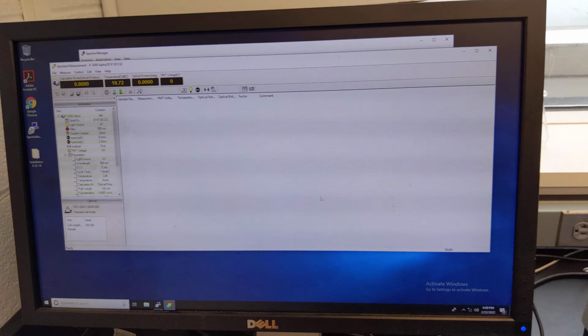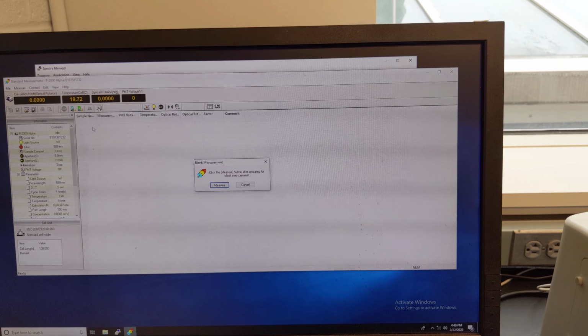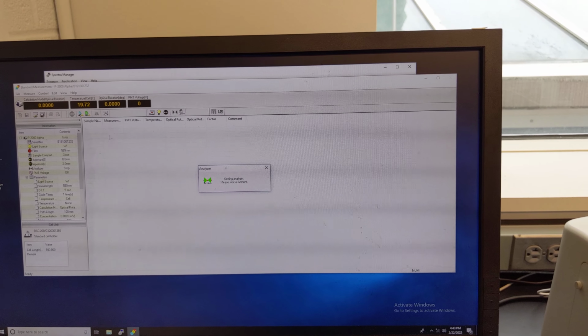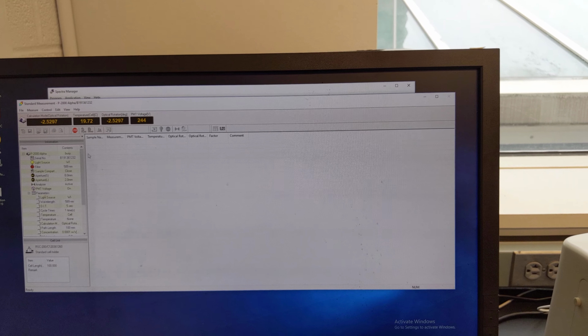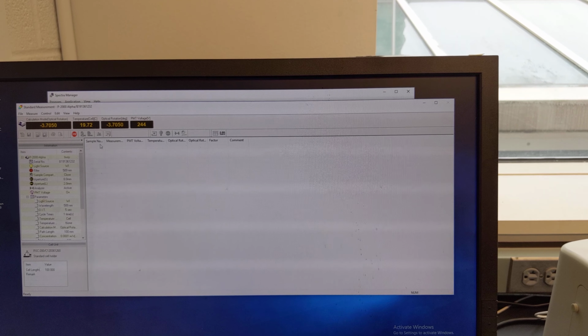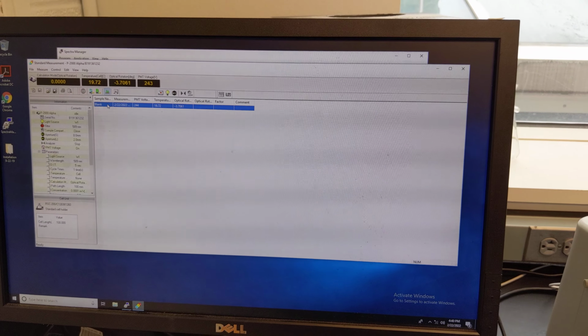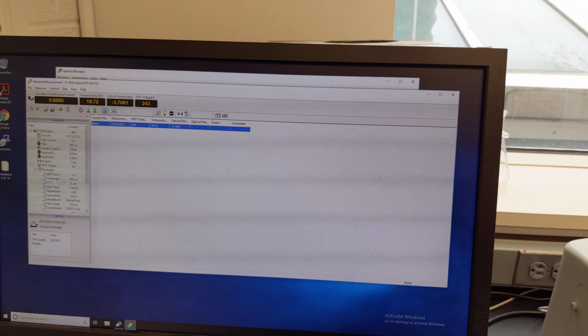Back to the software. We need to run the blank. It's this green B blank measurement. And click measure. When something is actively running, you have the option to click stop. You can tell that it's done because stop grays out and your sample appears here. So this should read 0.0000, so this is good.